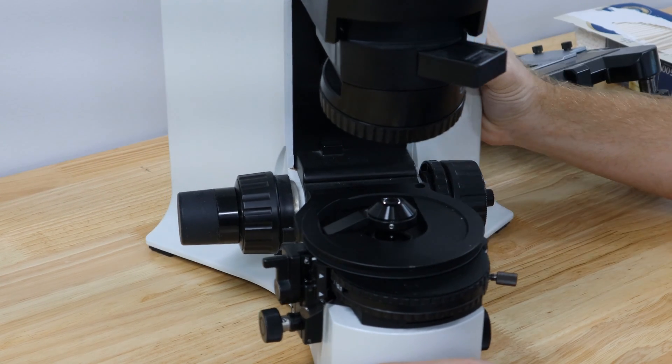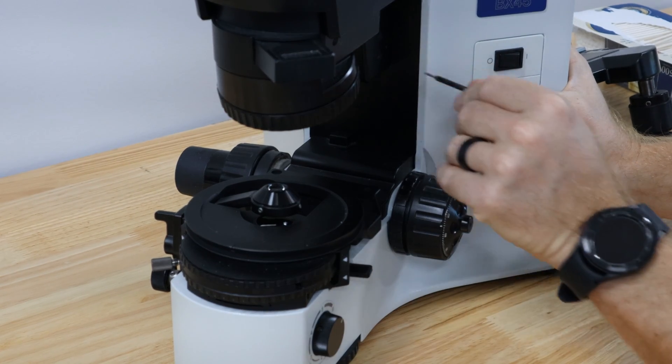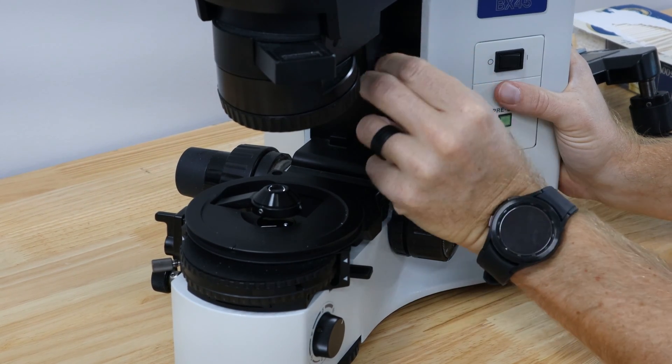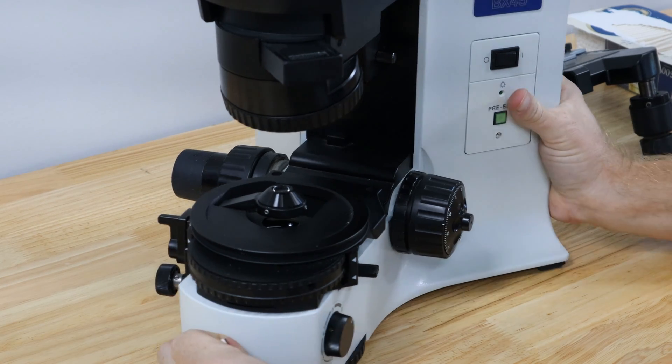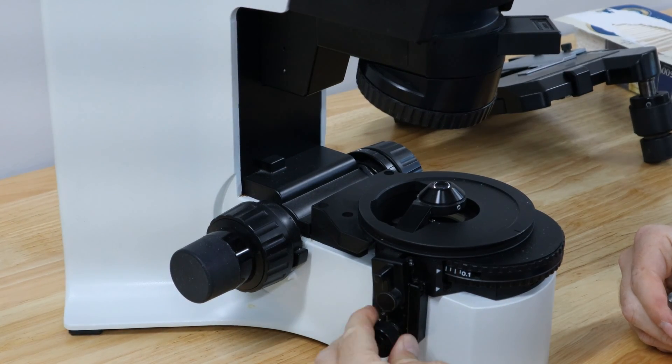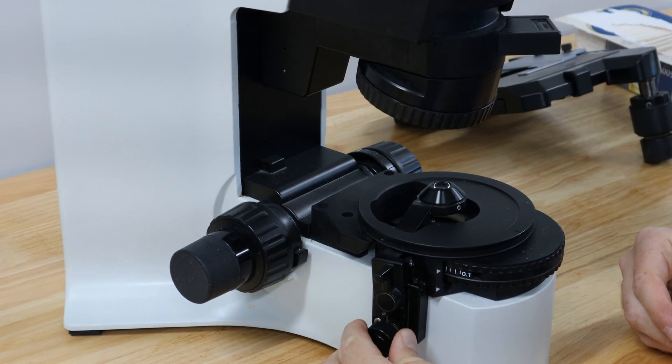But a lot of folks don't know these are there so we just wanted to show how to get these pins out and how to set Kohler on the BX 45 to move the condenser up and down. You're going to use this knob right here. That's going to move the top element of the condenser.